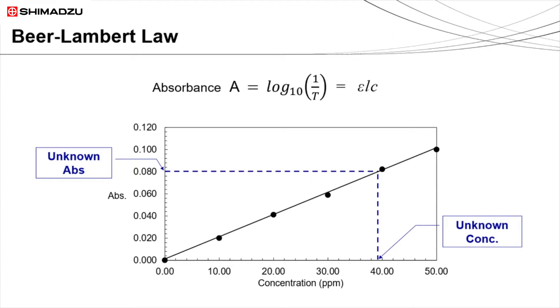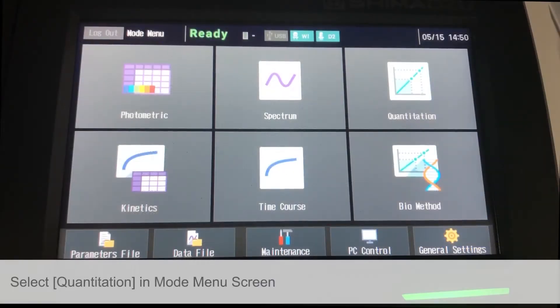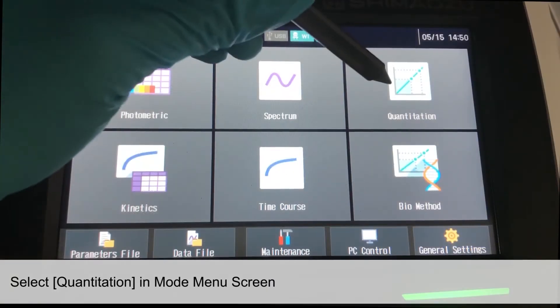Now, let's look at how the UV-1900I conducts a quantitation analysis. From the Mode menu screen, we will select Quantitation.